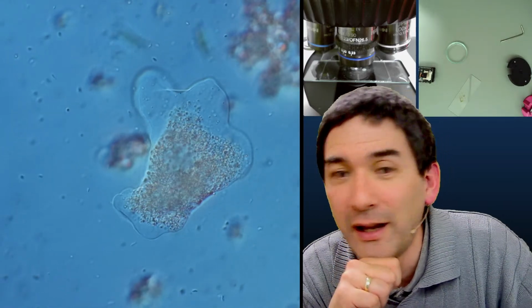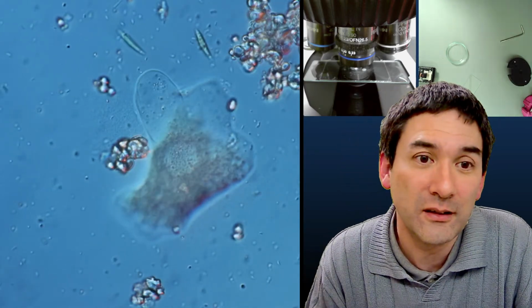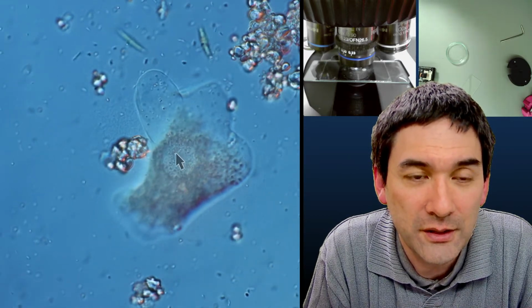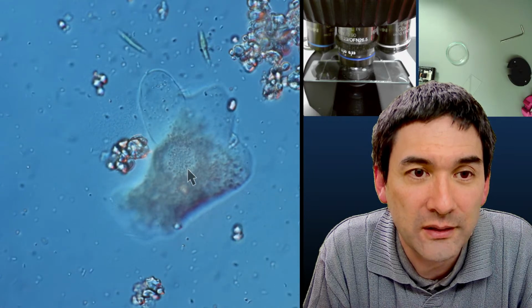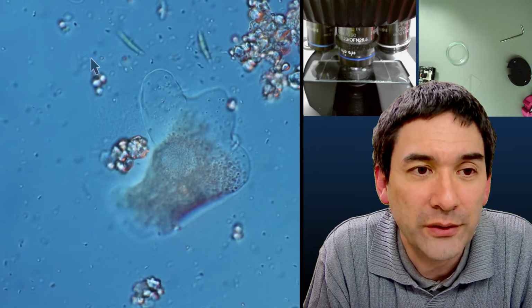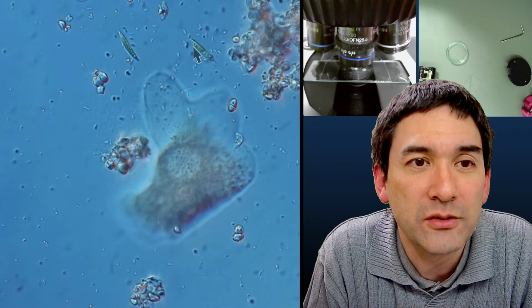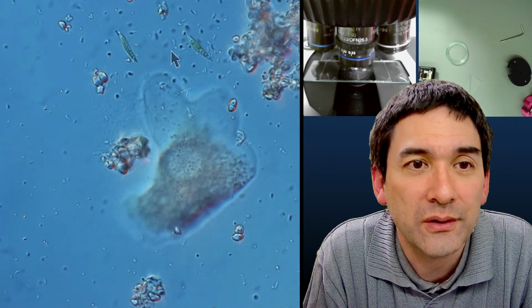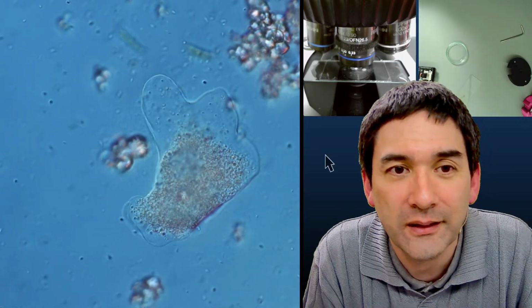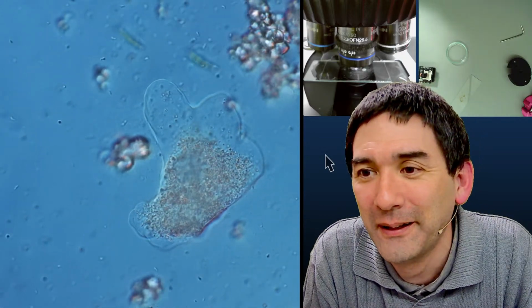Okay, go on, buddy, rehydrate. Yes, it's slowly rehydrating. Oh, look at this. Can you see it? You should be able to see the nucleus here as well. Let me turn on the arrow. See this round thing here? Could be the nucleus. And all of those things that you see floating around here are bacteria, those tiny ones. And those might be either some green algae or some diatoms. It's slowly rehydrating. As long as it's not popped open, I think it's going to be fine after some time.